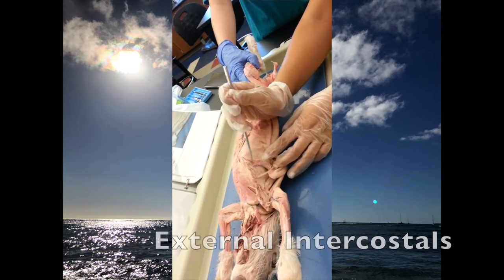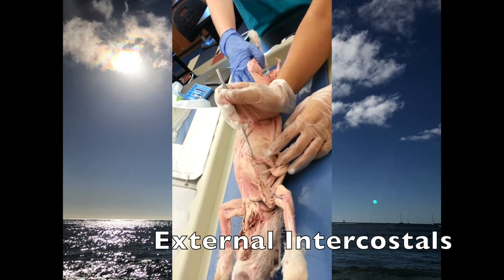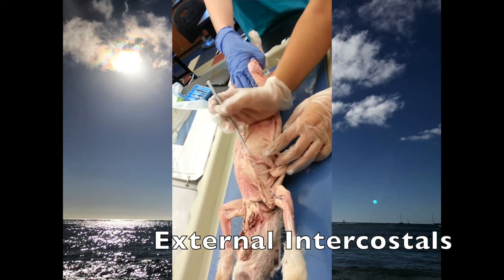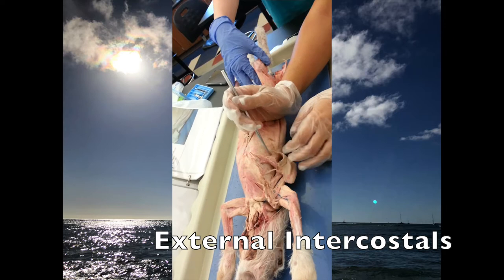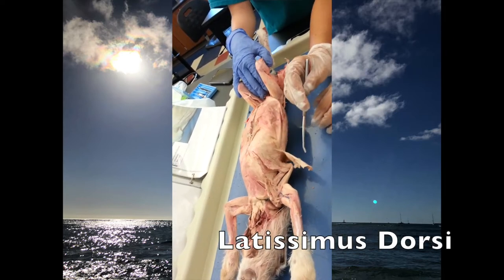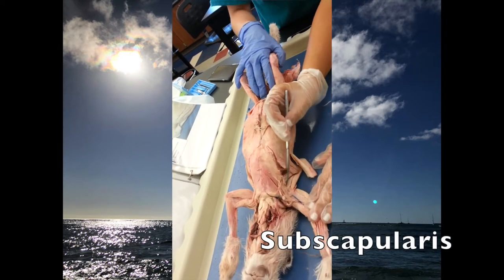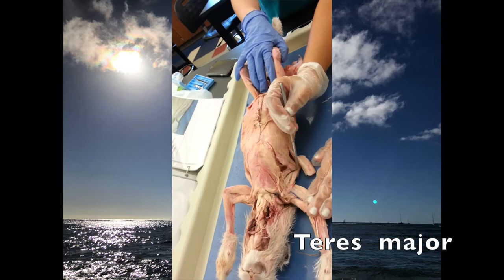In between the ribs you have the intercostals — the external intercostals. This flap is just the latissimus dorsi, and the subscapularis is inside, and the teres major is up next to it.